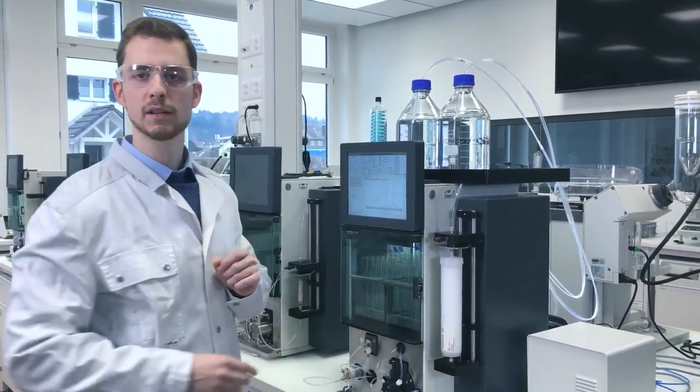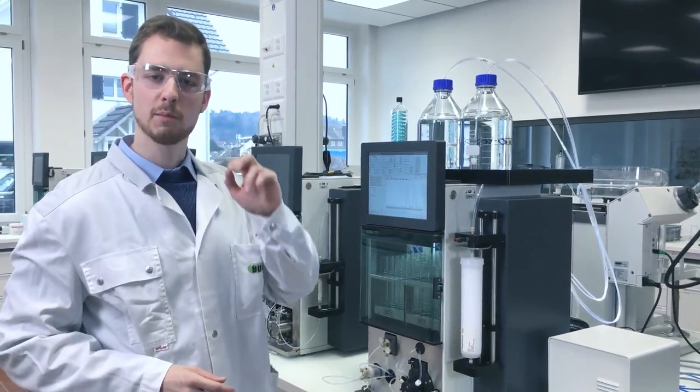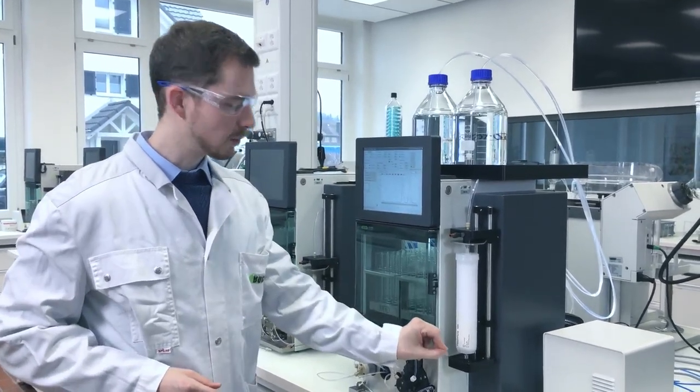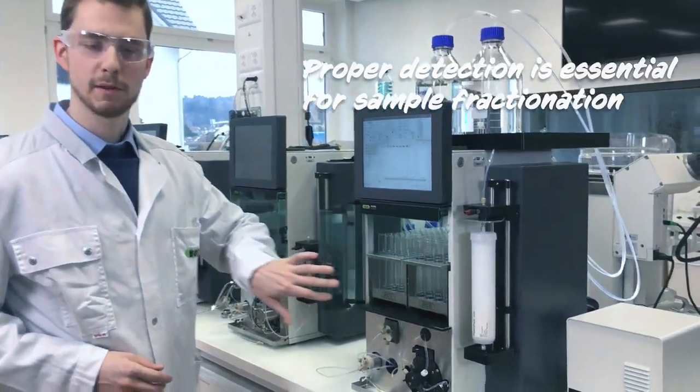To properly collect all the substances, the system needs to see all the compounds to determine the exact point when they are eluted from the column to achieve the optimal fractionation.